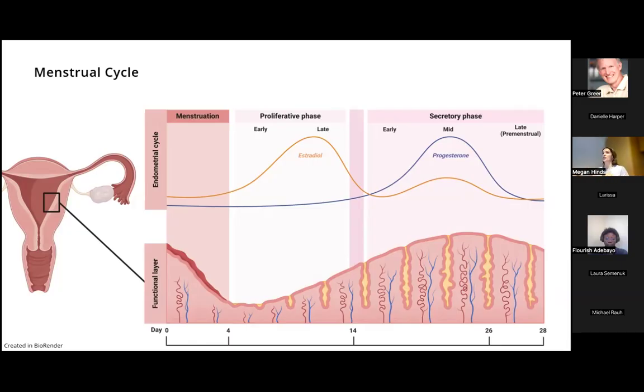Non-adherent cells have to be washed away within a few hours, because even with red blood cell lysis, even with Histopaque separation, you have a lot of red blood cell contamination and other cell contamination. So the limitation is that these are kind of messy samples, obviously, right?